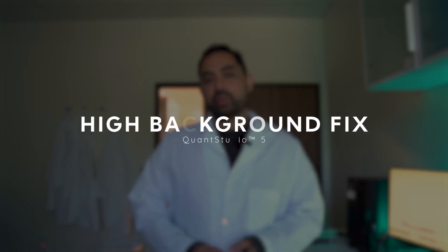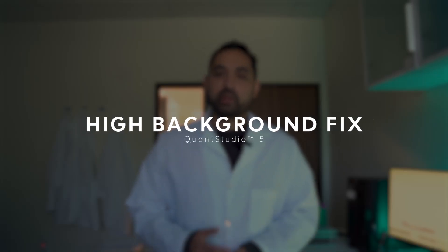In this video, I'm going to show you what to do when you have high background on your instrument. So what is background? Background is noise that the instrument is giving off. It's going to interfere with your results.